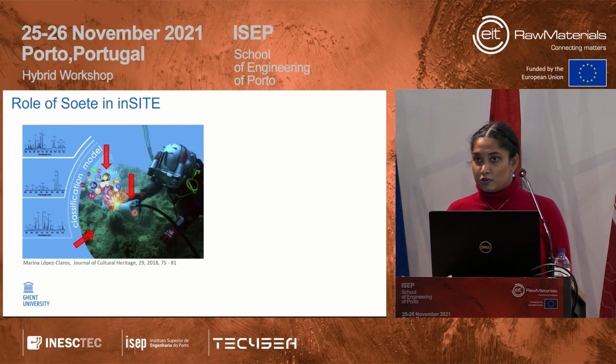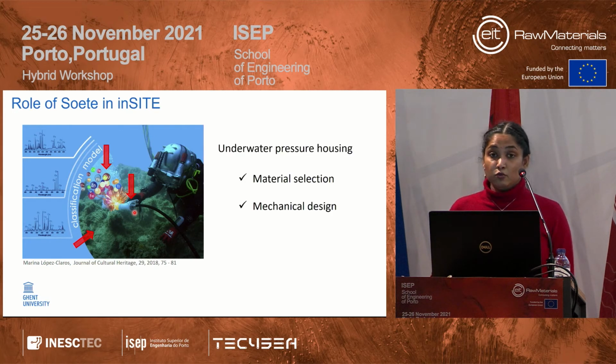You have the electronics, the mechanical components, the cameras, the sensors, everything, but they have to be encased in a system that works in harsh environments. When I say harsh environments, I mean the sea, the interaction with minerals or sands, and definitely the pressures. That brings us to our role in this project, where we are involved in the material selection of the housing as well as the mechanical design.